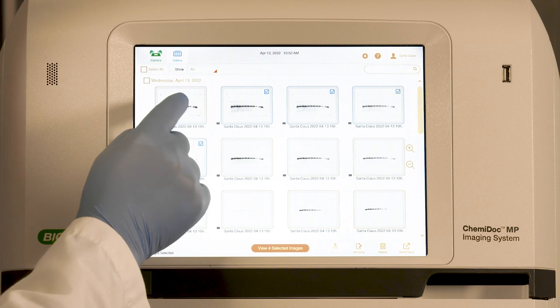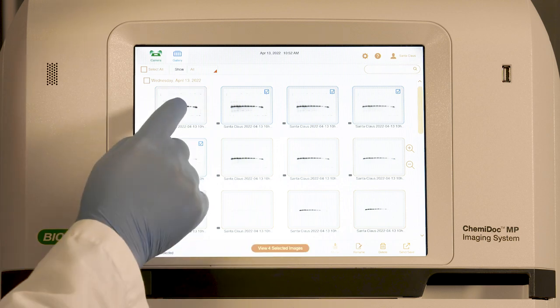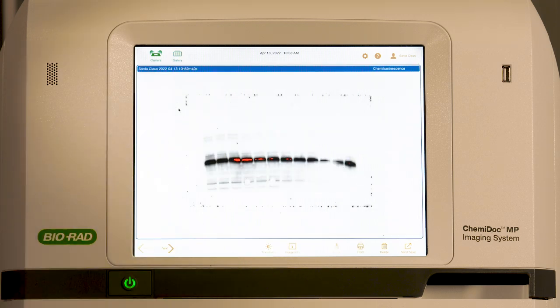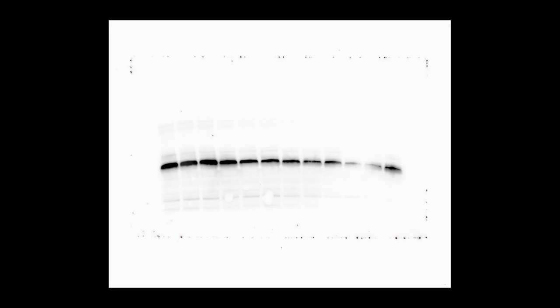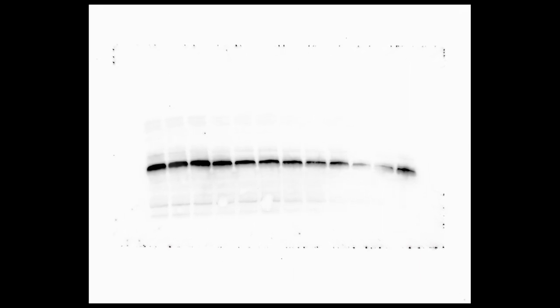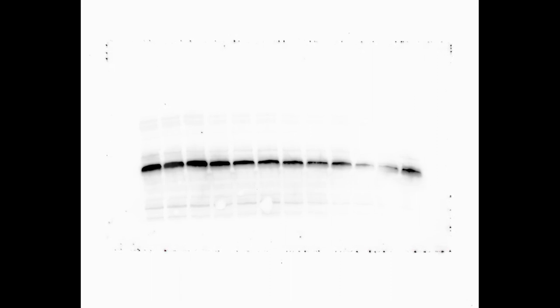Scan through the images to select your desired exposure time. After determining the best exposure time, which is to say the highest intensity signal with no saturation, we recommend taking a single image of your blot using that exposure time. This eliminates the extra noise introduced by the signal accumulation process.